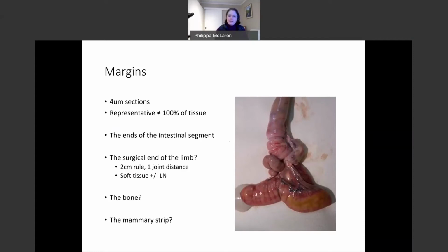It's easy with something like this intussusception. We can see where the lesion is. We're still going to cut it up, and it's obviously an intussusception for those that have had to deal with them surgically. But we want to look at the proximal and distal margins. We also want to look at the area of relevance, and we'll try and look for lymph nodes that are involved in that process. And the scientists are all well trained to understand the anatomy of the tissues, but they also value more advice and information. The pathologist will step in and have a look, but you having access to the wet tissues can often advise that best. So take the bits of interest.